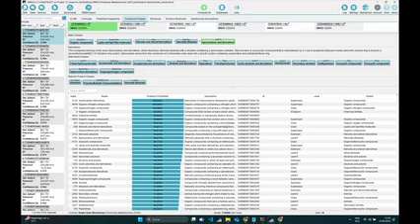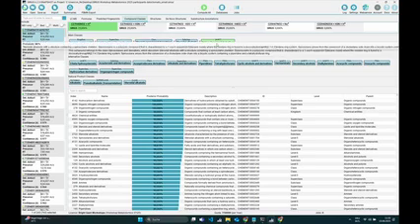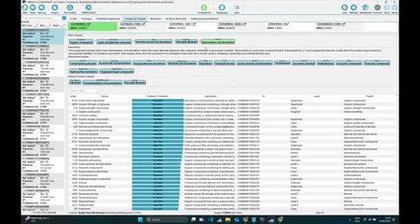Okay, now the next step is the compound classes tab. I'm not going to go into too much detail, but as Markus said, we also predict compound classes, and you can see the classes which are predicted. The main class here, or the main classes here, are the classes from the classifier ontology, and in the top row you will see the hierarchy. So the most specific class that we predicted is this of spirosolanes and derivatives. You might want to remember this a little bit for the next step.